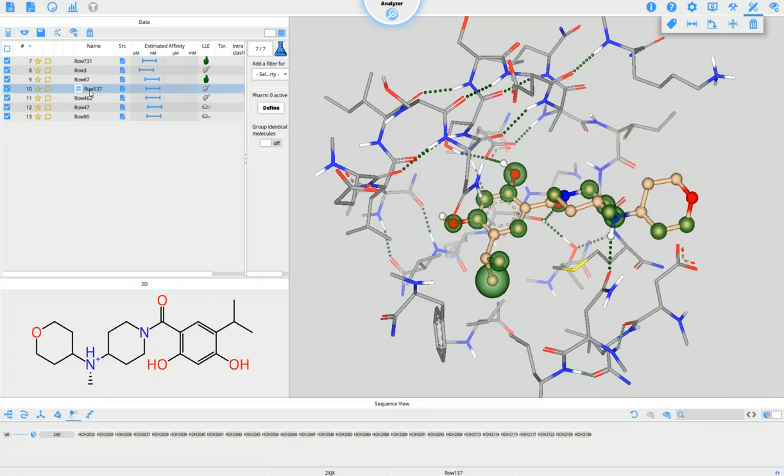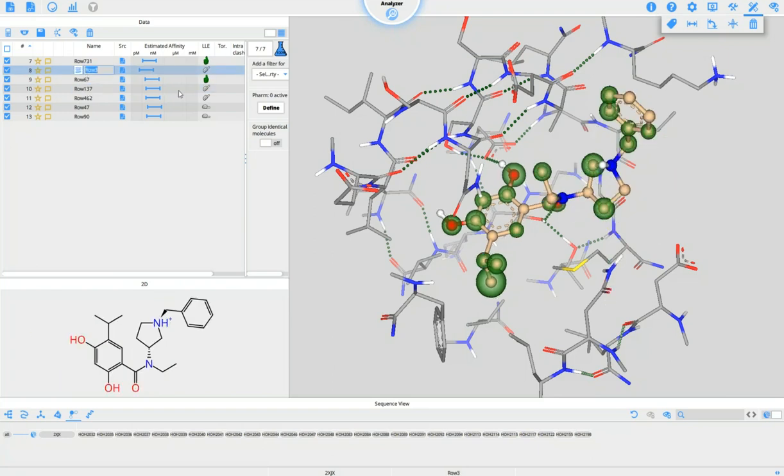By the way, if they have weird names, then you just double click on this and rename this as my best or whatever your name is, and just confirm it with the enter button, no, not button, key on your keyboard, sorry.